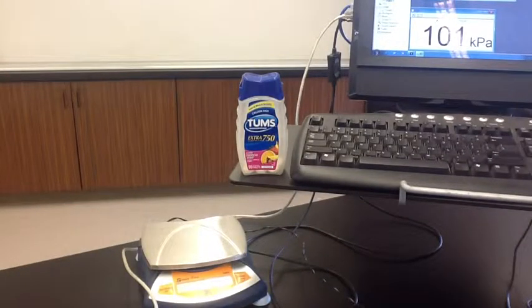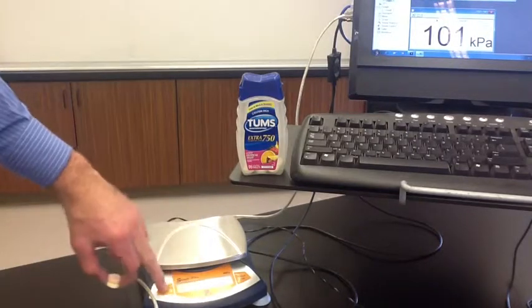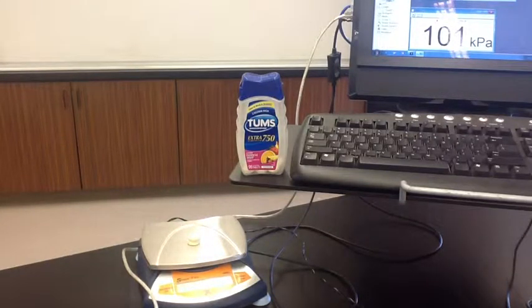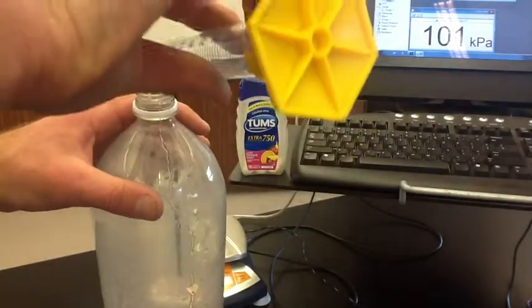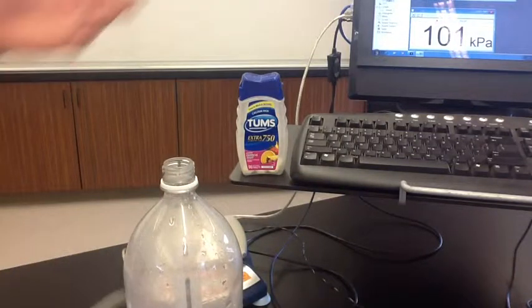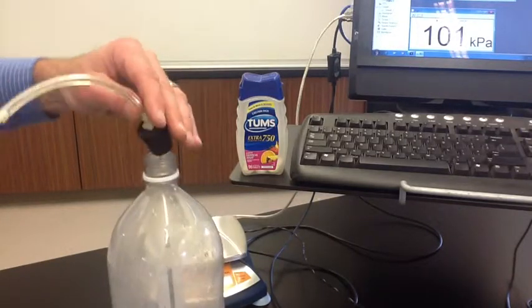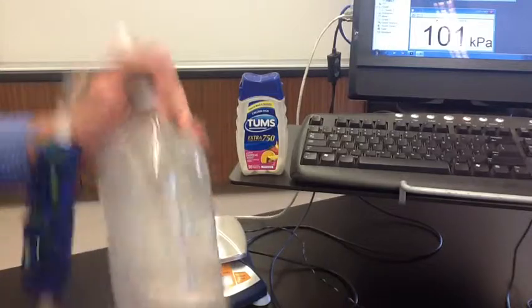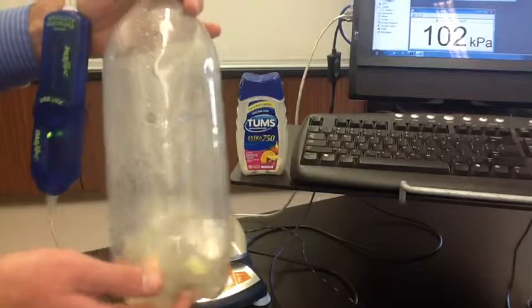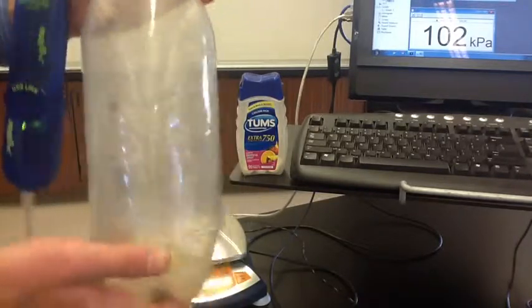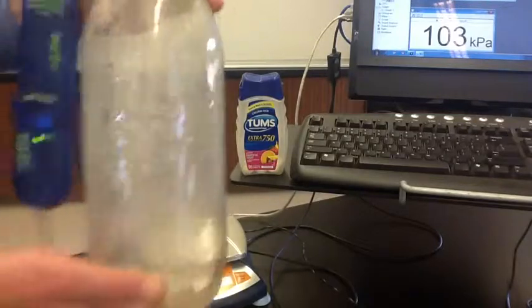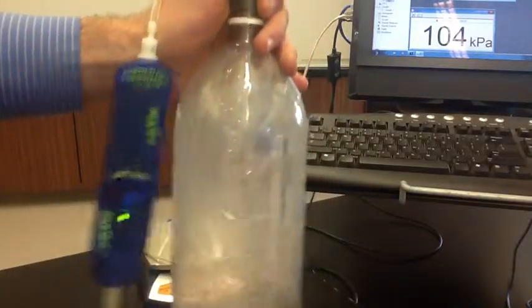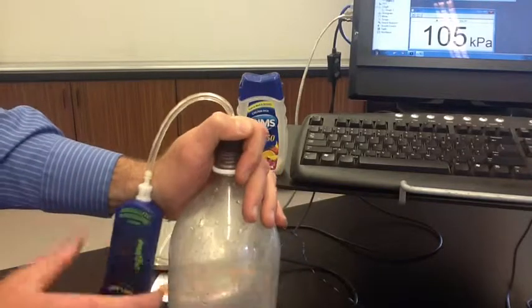We're going to repeat this experiment one more time, this time using a store brand antacid tablet — we want to be able to compare these to the Tums. We'll take our store brand antacid tablets, and they are 4.9 grams. We'll take a 2-liter soda bottle and add 50 milliliters of hydrochloric acid, and do the same thing. Starting pressure is 101 kilopascals, and we'll see how much it increases. The store brand antacid tablets are a little bit bigger — we're going to find out if that's because they contain more calcium carbonate, or because they contain more sugar, flavoring, and coloring. You can use this information to figure out which would be a better purchase: is it worth buying the Tums brand, or is it better to buy the store brand?